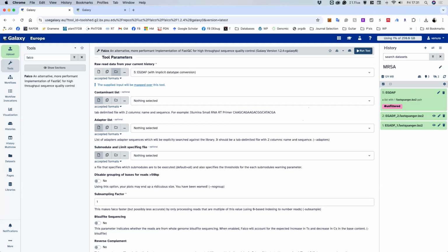So here we should select one file, one pair file. Yes, because we have only two, forward and reverse. Because, I mean, it's beyond the 2 days activity. Sometimes we make a pair collection.